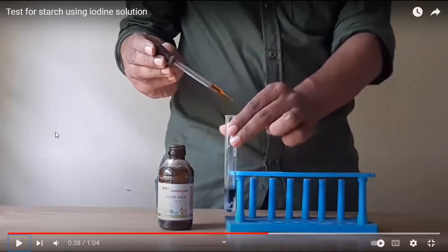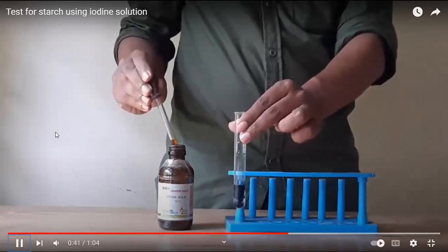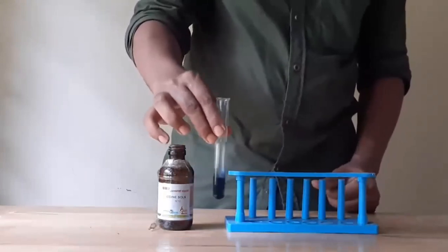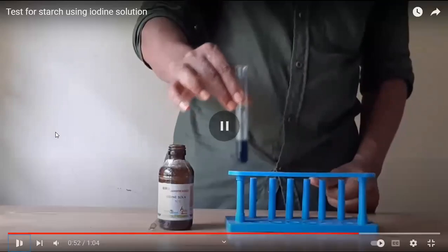Do you see the bluishness there? Yes, sir. The color changes. The color becomes a blue-black color. So it indicates that the food item contains starch. That's all. Clear?